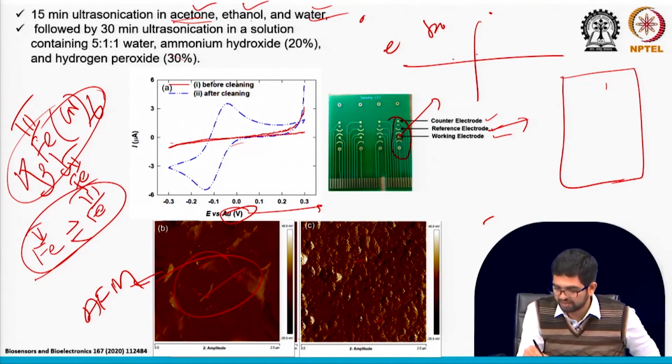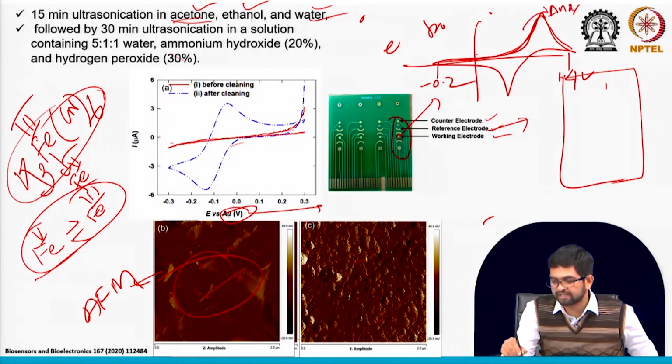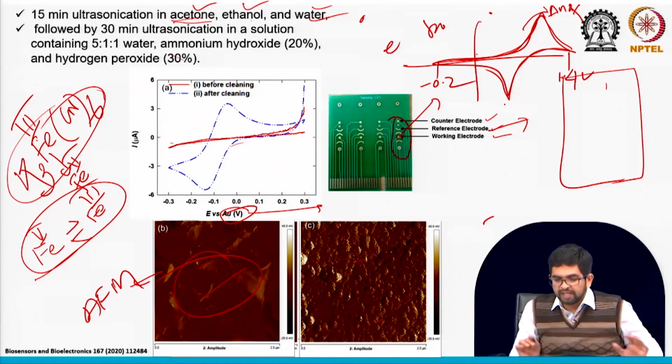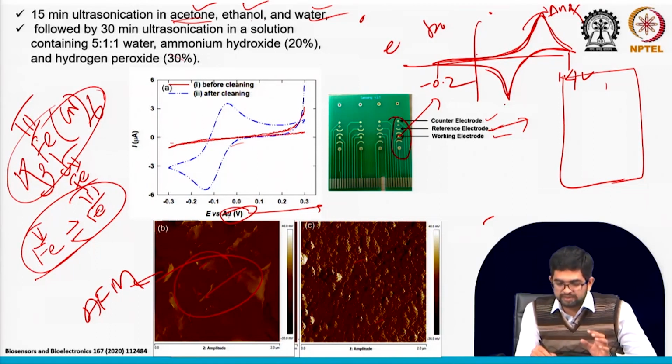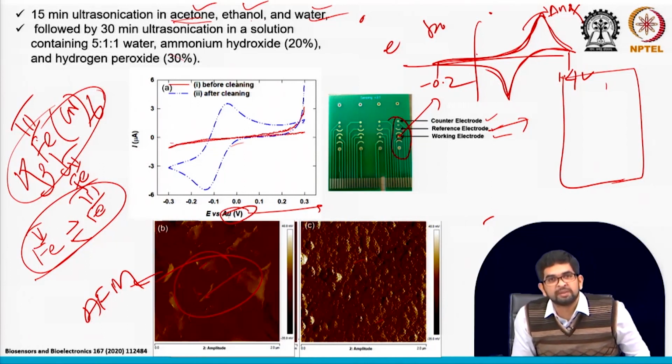Anodic treatment, you can remember, like gold will be oxidized, then gold will be reduced. So maybe from minus 0.2 to 1.4 volt, right? Gold can be oxidized, which means gold oxide forms, and then that gold oxide is reduced again. During this process, if the gold dissolves and copper is exposed, it can affect your sensor development, right?